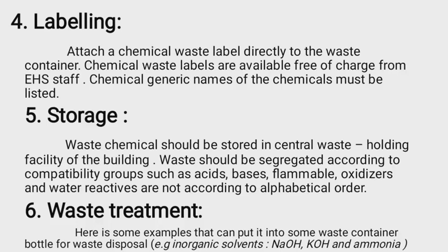And the last is the waste treatment, and how we handle these chemical wastes after the chemical waste disposal procedure. Here are some examples that can be put into the same container or bottle for waste disposal. Example: inorganic solvents, sodium hydroxide, potassium hydroxide and ammonia NH3.